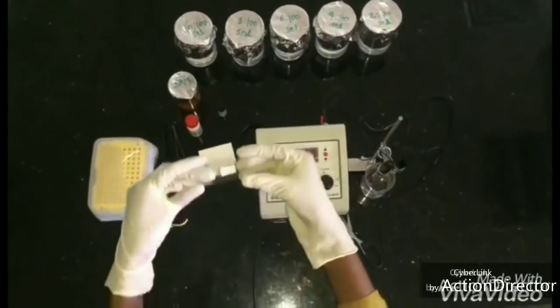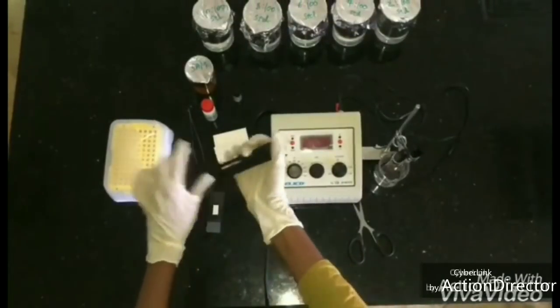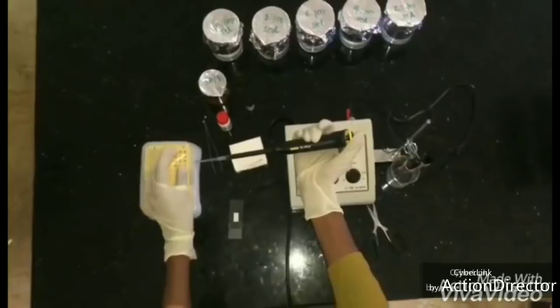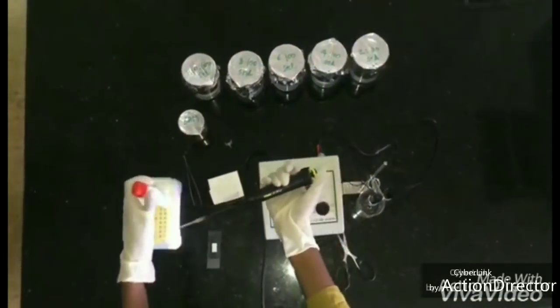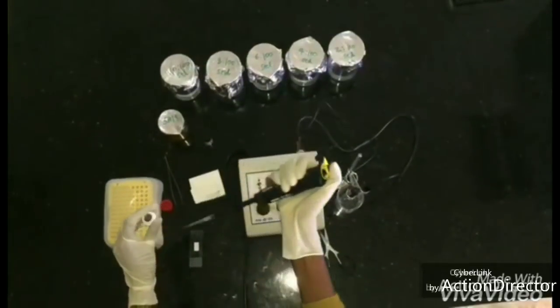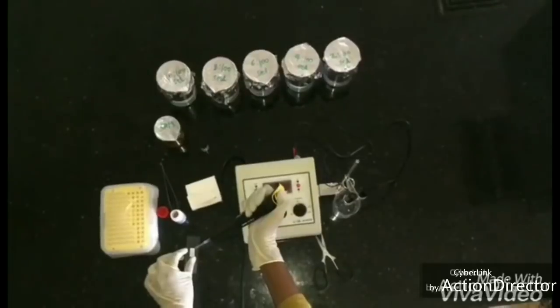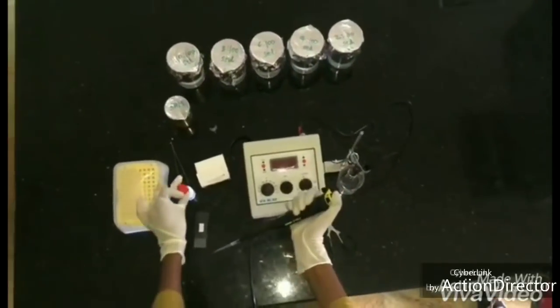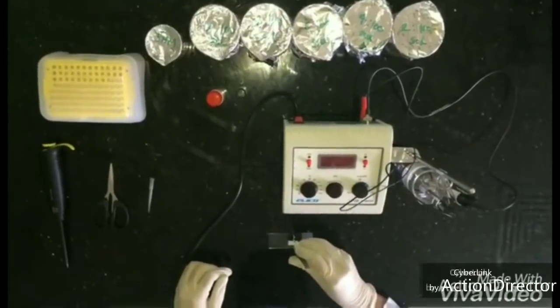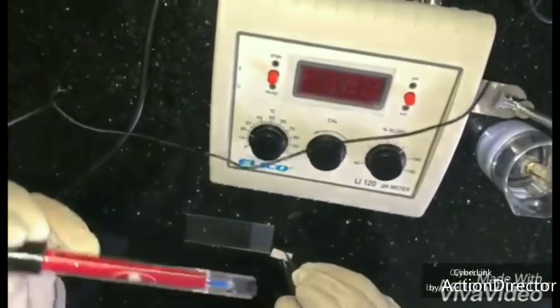One by one centimeter of nitrocellulose membrane is cut down into pieces. 20 microliters of uricase enzyme is pipetted. It is then incorporated in the polymer film. It is kept for air drying. The film is anchored in the reference platinum electrode.